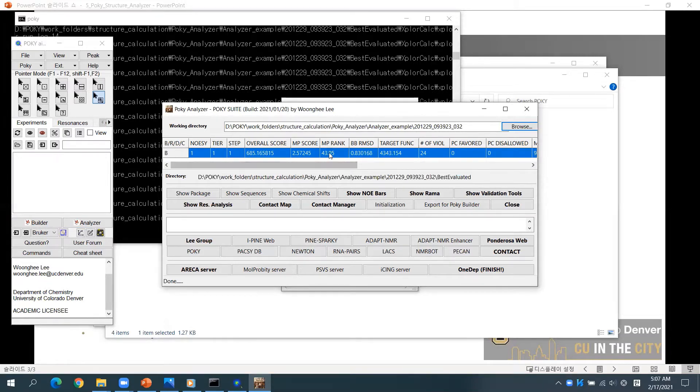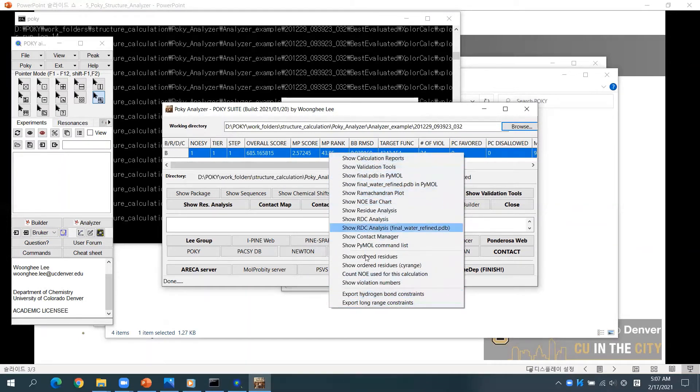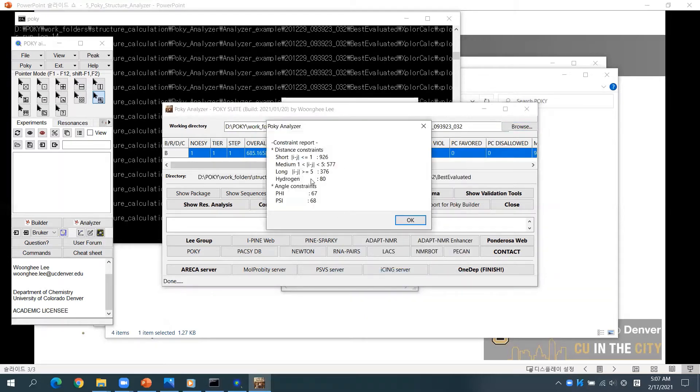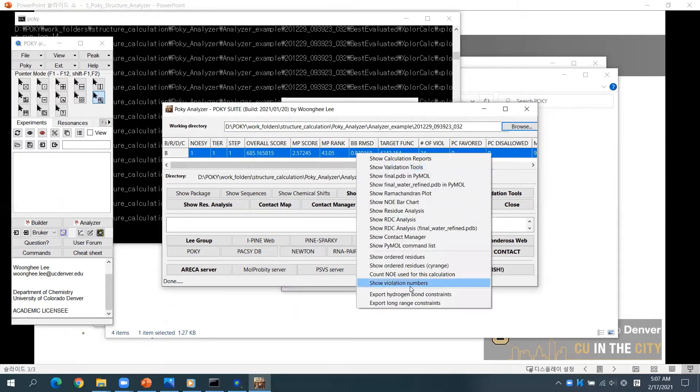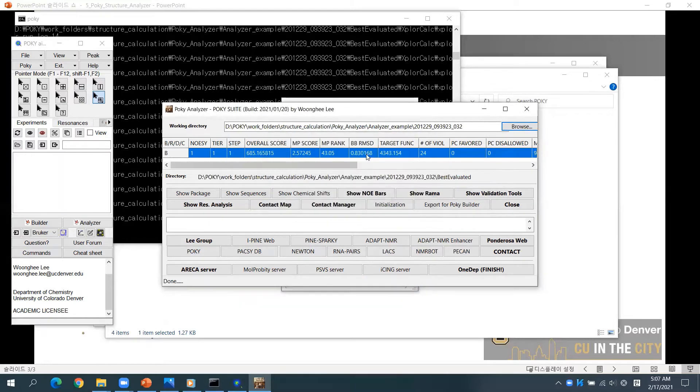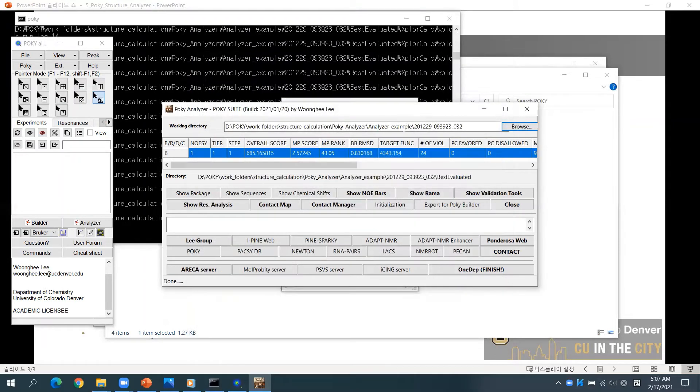If you right-click the table, you will find various validation tools. You can check the number of constraints, the number of violations, the calculation report, and RDC analysis.